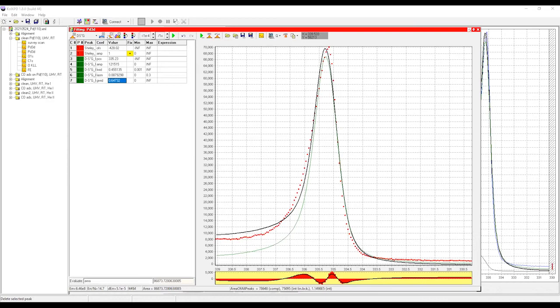However, between two different experiments, we always connect the cell. We fill it with a relatively high flow of oxygen, and then anneal the cell. I mean, we heat the stage where the sample is to a high temperature, like 500 degrees C. We can keep it overnight sometimes or several hours. This helps to more or less remove all carbon contaminations. Then it can also be purged by argon for a short time to remove oxygen. This is how we try to get a clean cell. But of course, as I said, it's not like UHV.